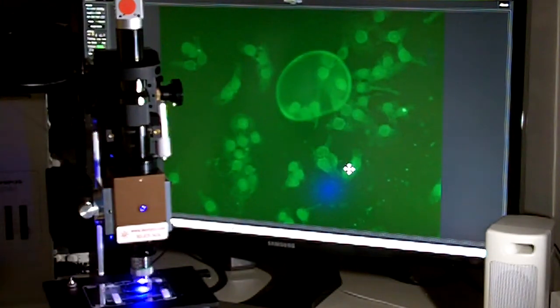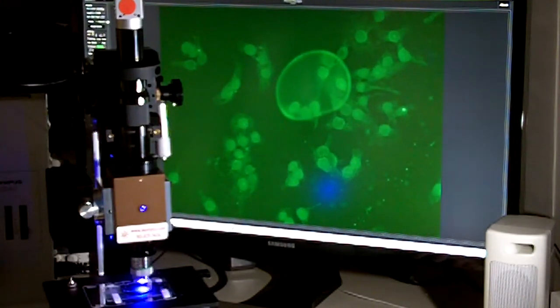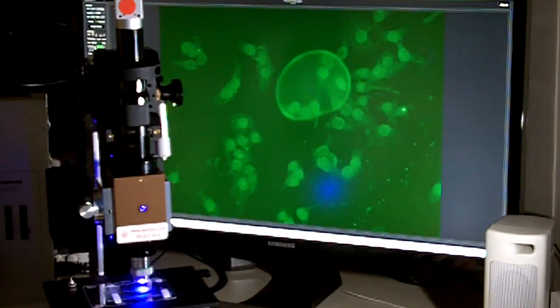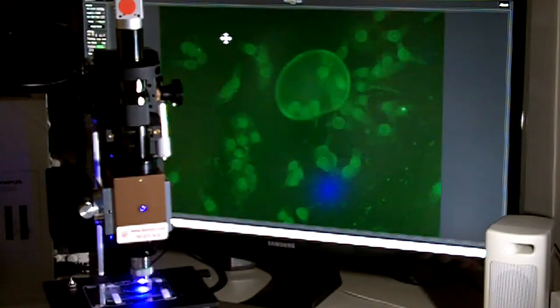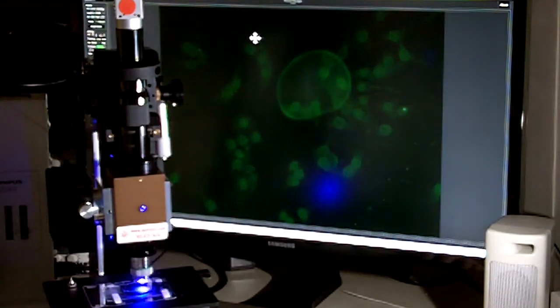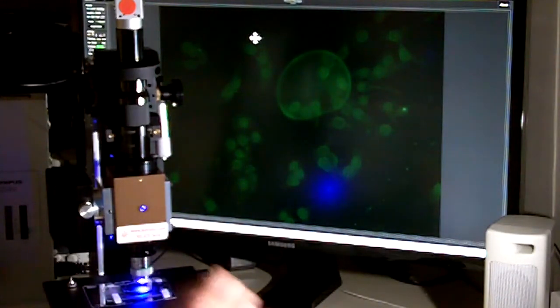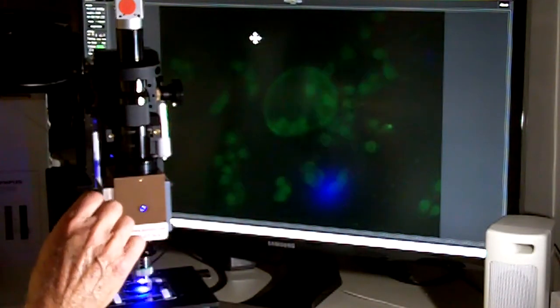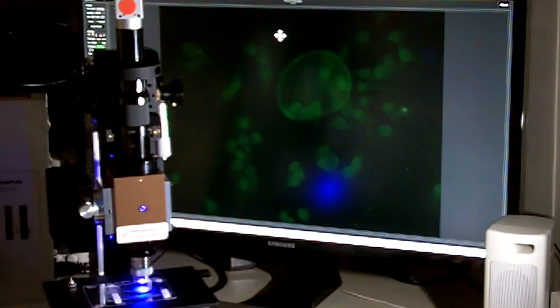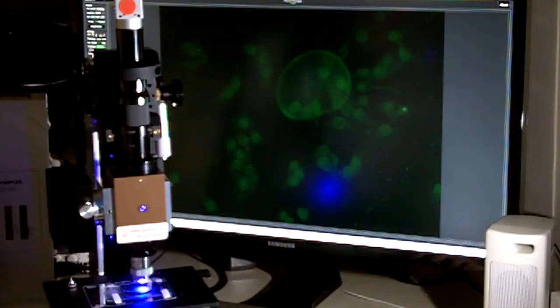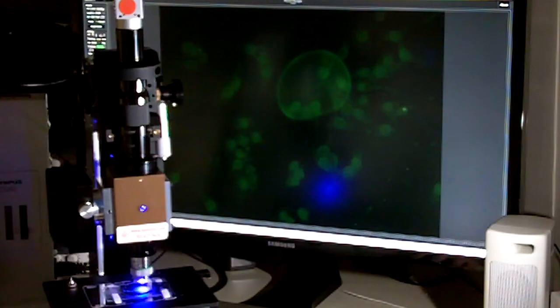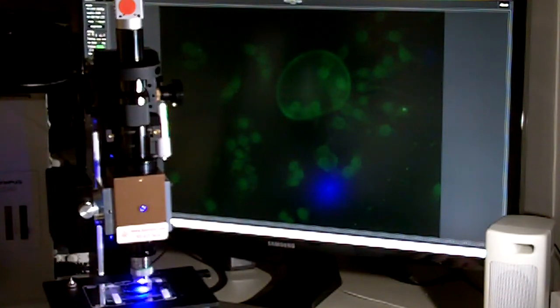Or we can go into the software and tweak the exposure and the gain. Here we can set the gain on automatic and turn it off if we need to and adjust the gain manually.